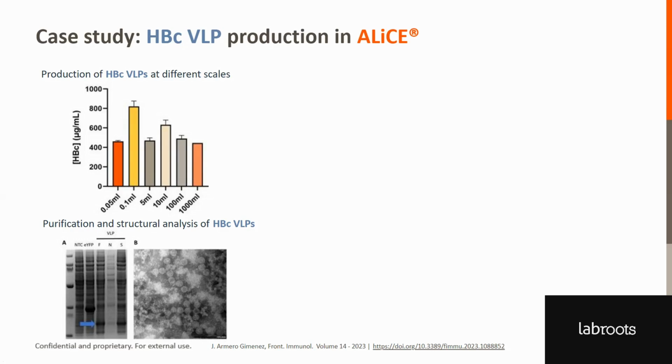Moving on to the purification and structural analysis of the virus-like particles. We could see fully formed virus-like particles in the lysate already. These are organizations of 180 or 240 protein monomers that form the particles, so they're quite sizable at scale. You go from the 20 kilodalton weight of the monomer towards these much higher order particles. And we used reverse phase chromatography to purify these particles from the lysate.